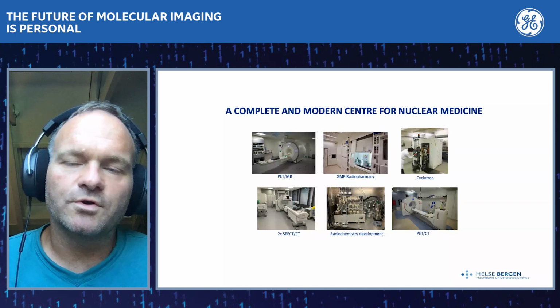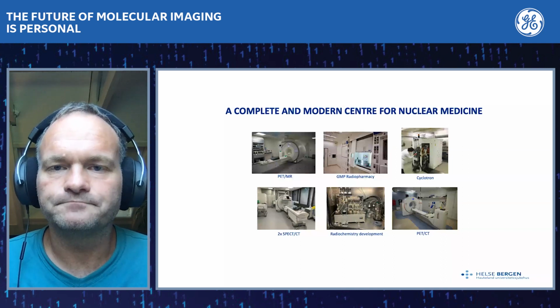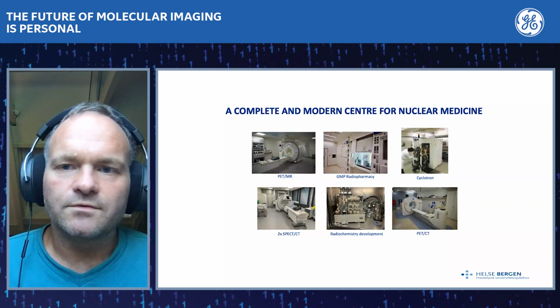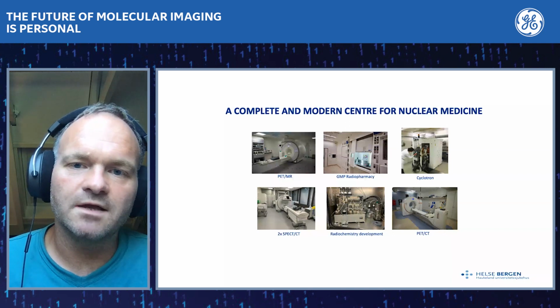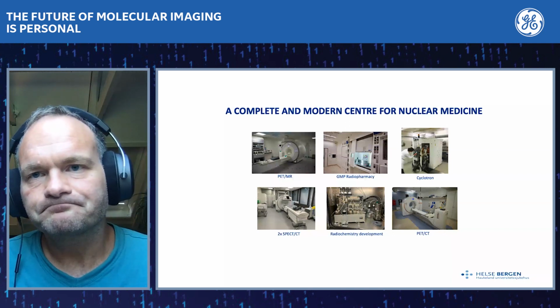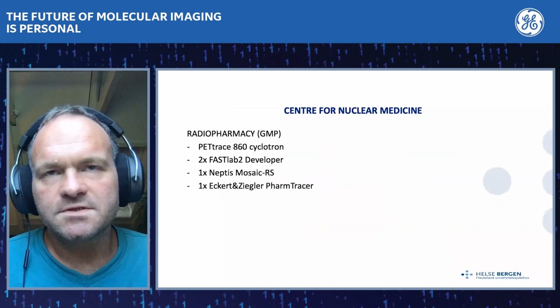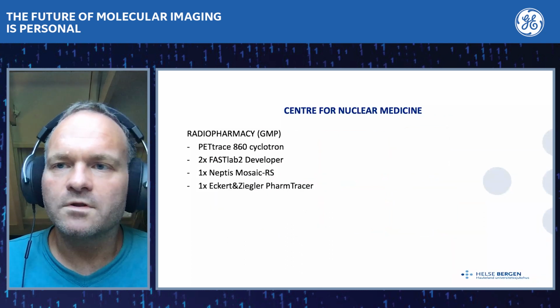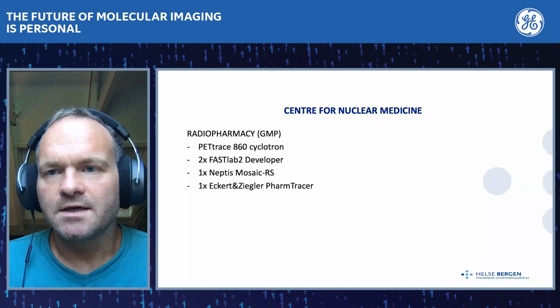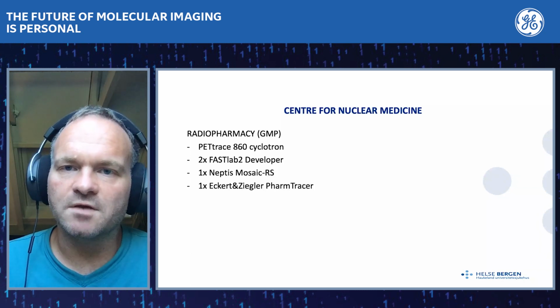The Radiopharmacy has been producing PET radiopharmaceuticals since 2011, and it's expanding its tracer portfolio under national regulations every year. Research and development in radiochemistry is conducted together with the Department of Chemistry at the University of Bergen and other partner institutions. The Radiopharmacy is currently one lab, which is a clean room grade C, where all the radiopharmaceutical productions take place under GMP and national approval.